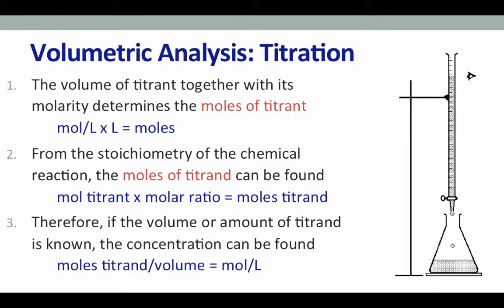The concentration of the limiting reagent is simply the number of moles that reacted with our titrant divided by the volume that our limiting reagent was in.